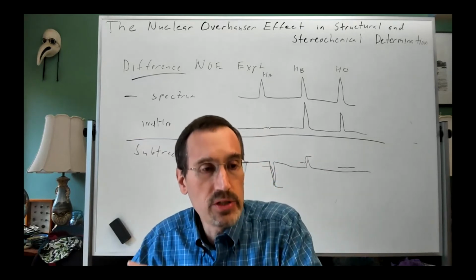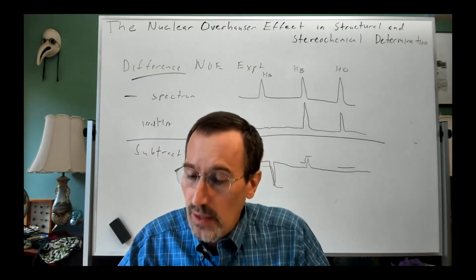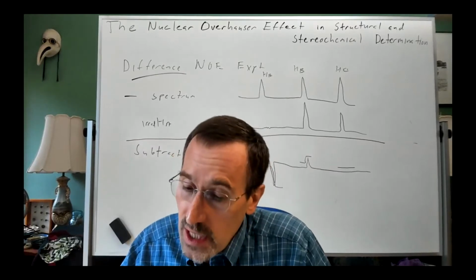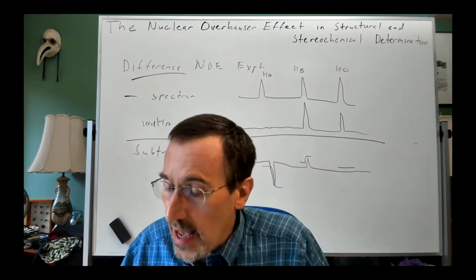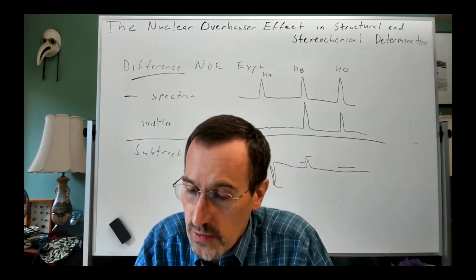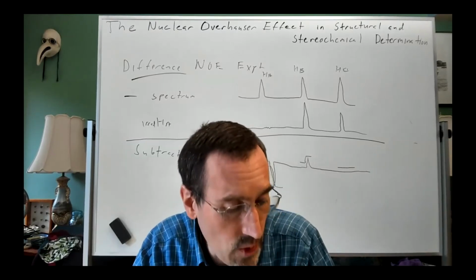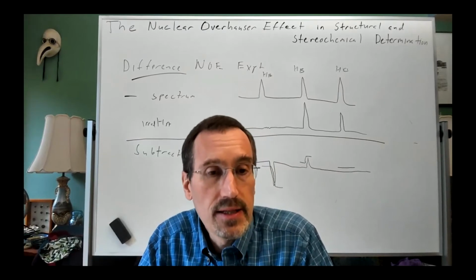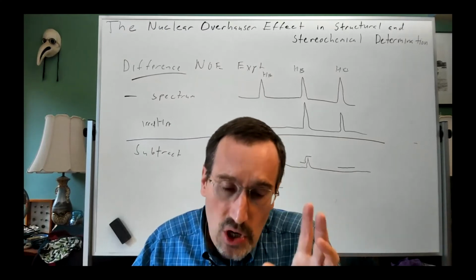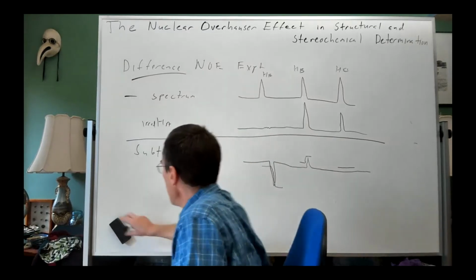Basically being able to check and then being able to do other resonances. So for example, I don't know what the structure of this molecule that Derome was using was, but I might have wanted to not only irradiate that doublet at 2.2, but also irradiate the singlet at 4.2 and ask, okay, what happens on it? There are some other subtle things as well, in that an NOE isn't always evidence of proximity, although the strong NOEs typically are.